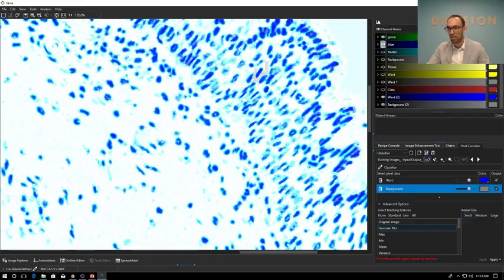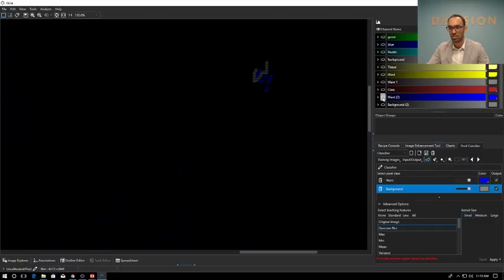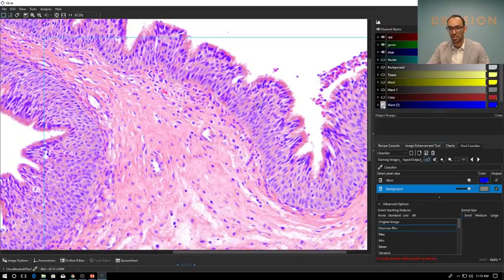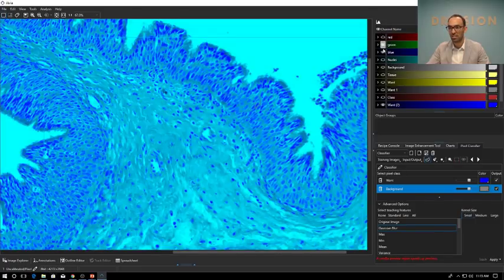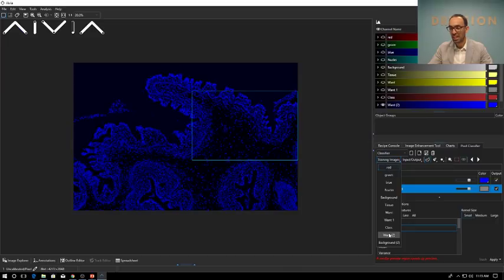So that's this last channel that I created. This one here. So that's the new channel, that's the background. That's the channel I just generated from this image. And you can see the nuclei are all detected. Okay, all right, so that's the pixel classifier, kind of a short crash course. You can select multiple training input channels, as I mentioned. If you're applying, you can apply it to multiple output channels here. And this is where you would select the features that you're interested in, and the kernel size is over here. So pretty straightforward to use.